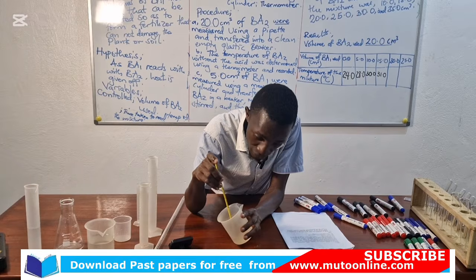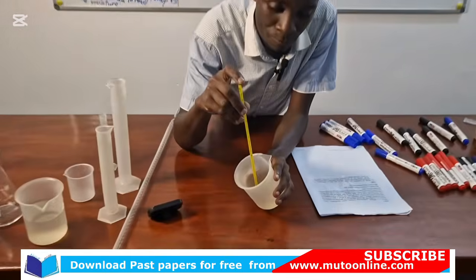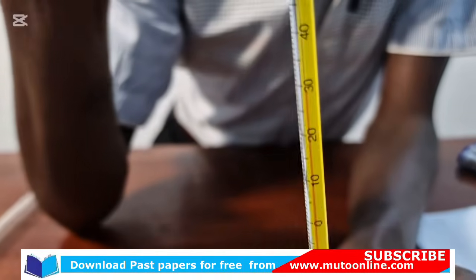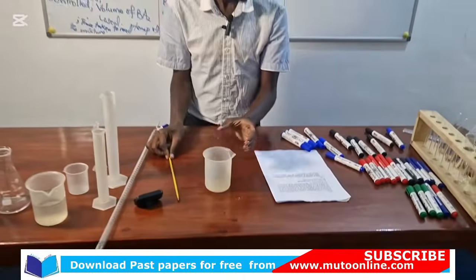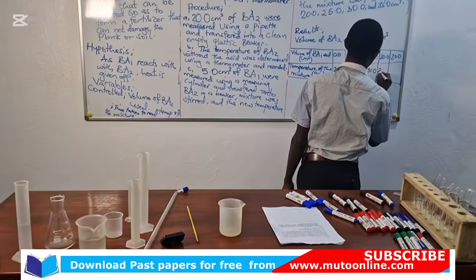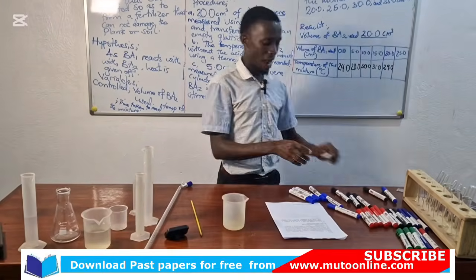Or you wait until the thread is not moving anymore. Here is my reading. It is stably stopping at 29. So my new reading is 29.0. I'll add more 5.